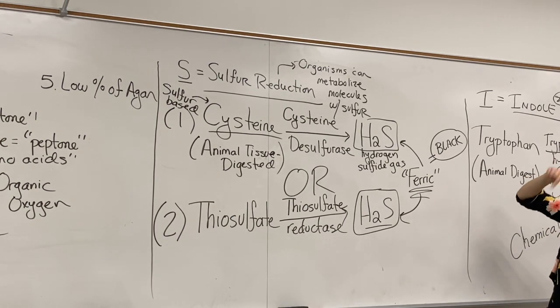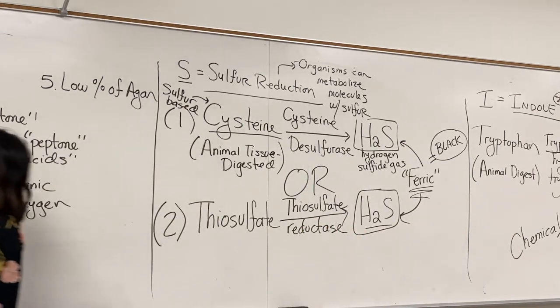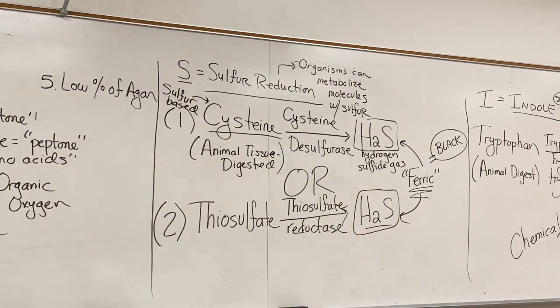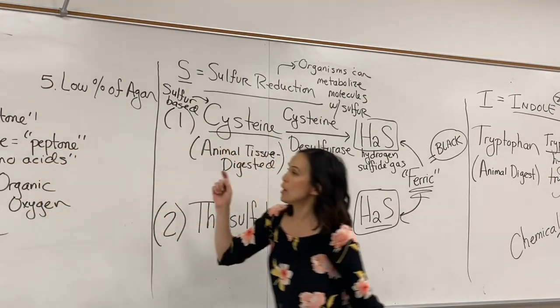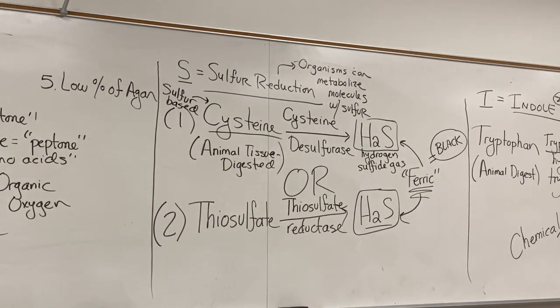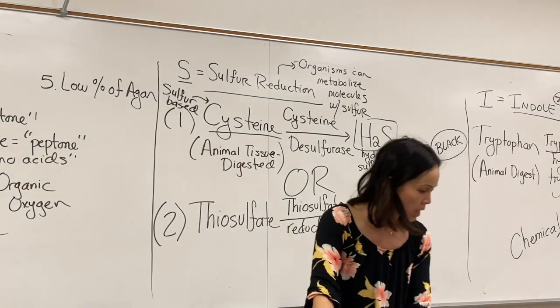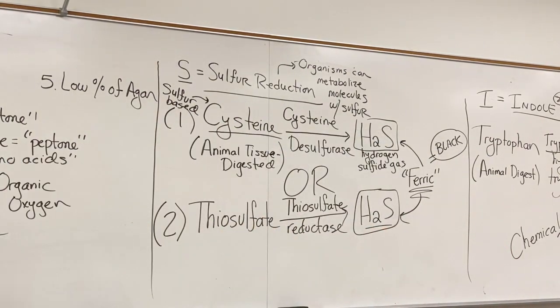So when you look down on it through the cap, you'll notice you'll have more of the spreading effect on the top layer. So anyway, you can check out the motility. We'll look for the black, but the most important piece is we'll gather the indole. So let me tell you guys how much chemical to add, and then that'll be it. But do you guys have any questions about anything there?